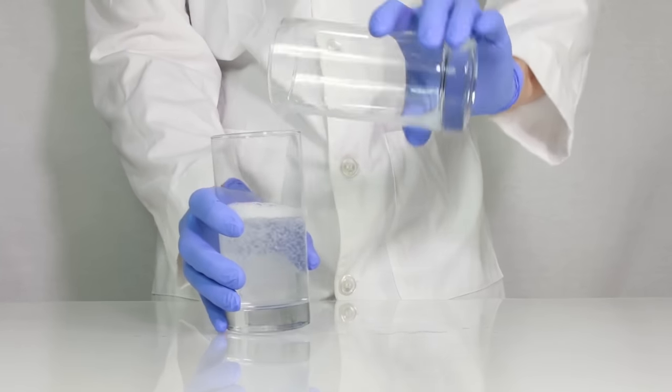Bearded Science Guy here and today I'm going to show you how to make an iodine clock reaction. To start with, pour 128 milliliters of warm distilled water into a container.